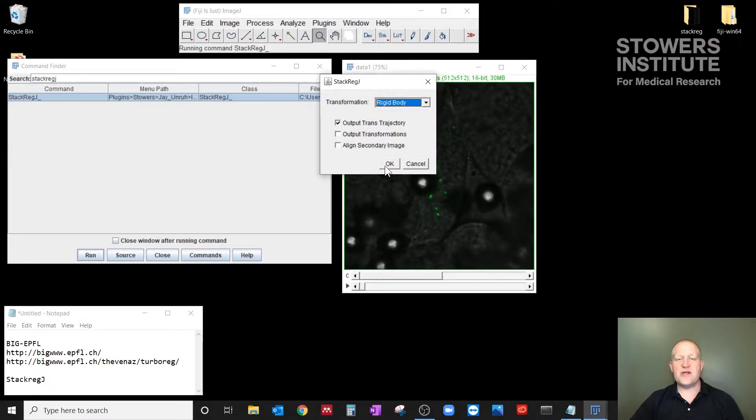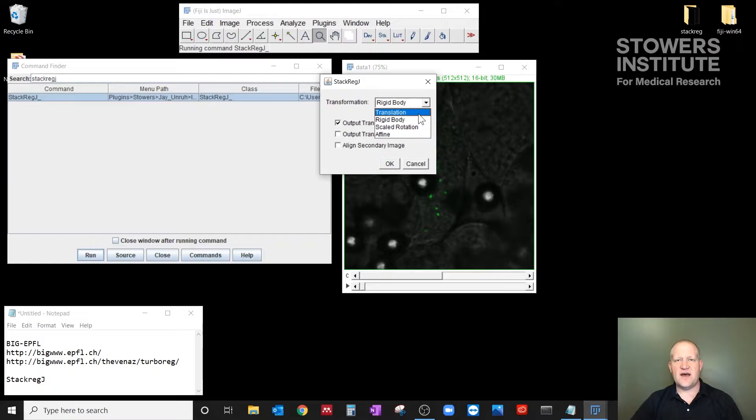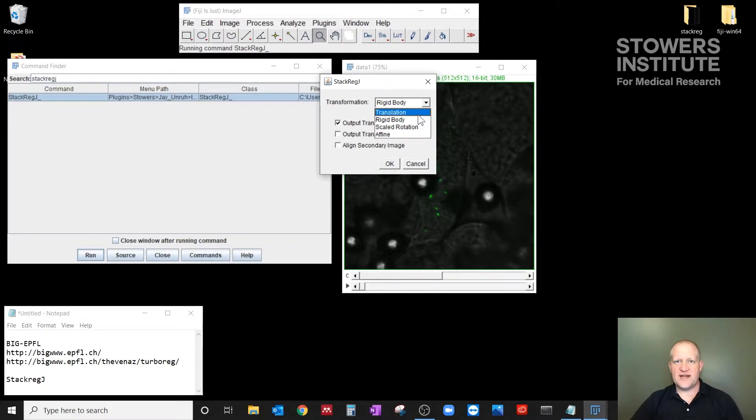So it brings up this window and gives you a couple of options. I'm going to show you the drop-down. Translation is the simplest registration algorithm, and it does not alter your data in any way. Everything from here, Rigidbody and on, will start to alter your data in some way.